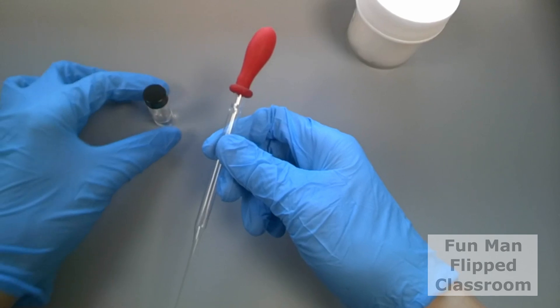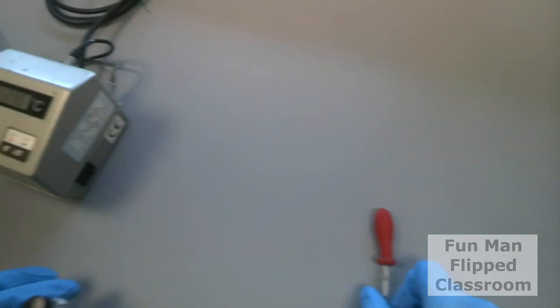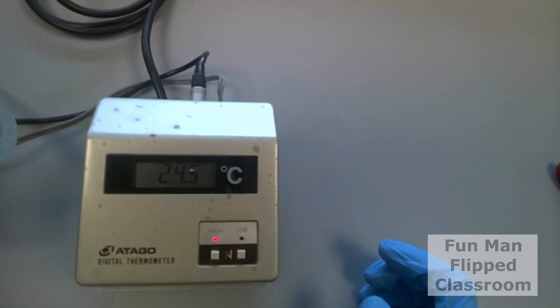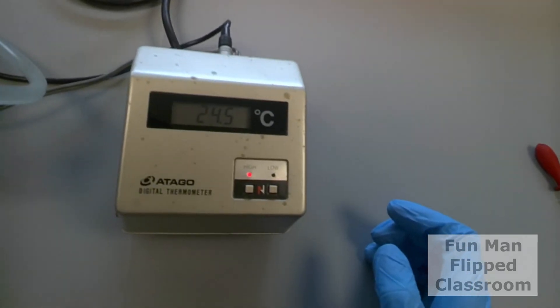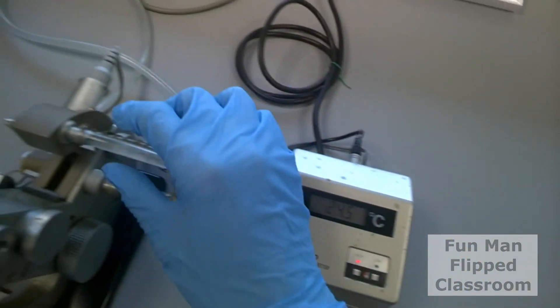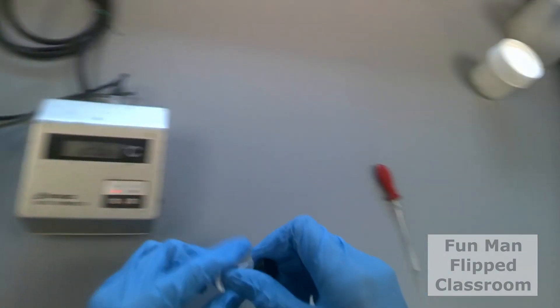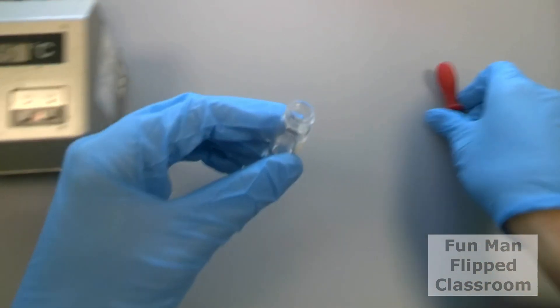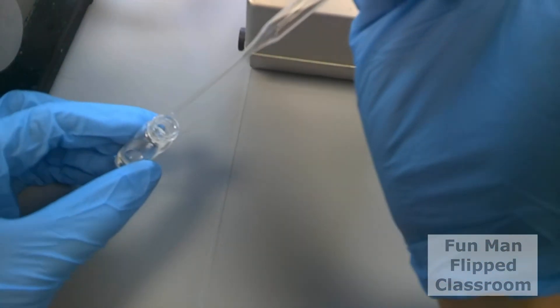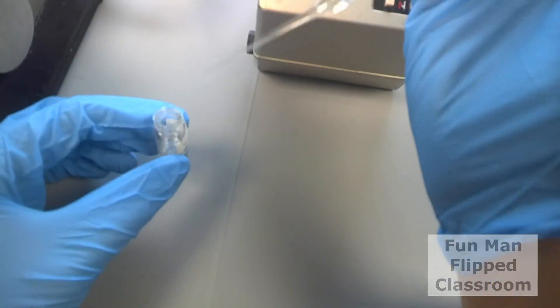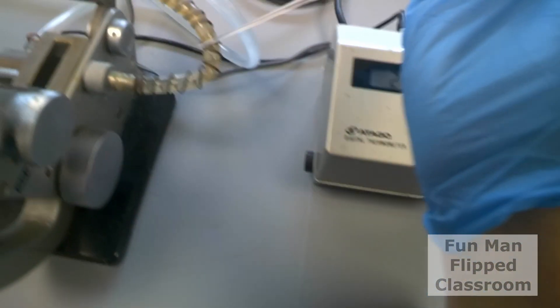Next, take your sample from the vial. Note the temperature again. And withdraw the sample using a glass pipette.